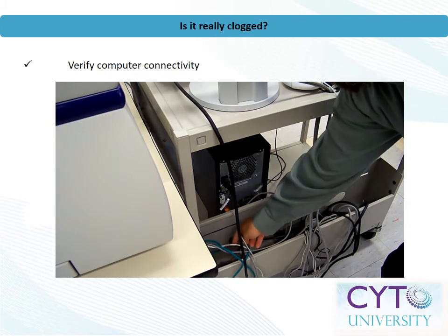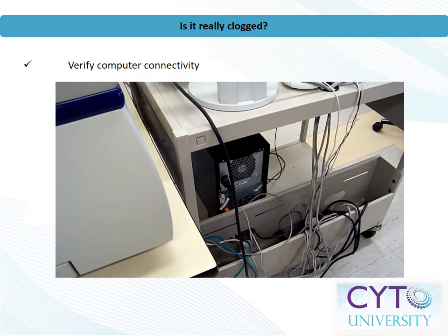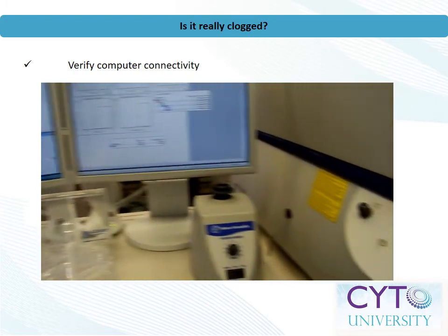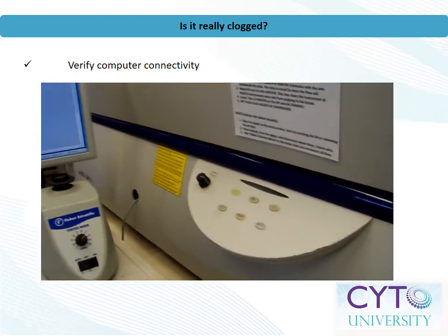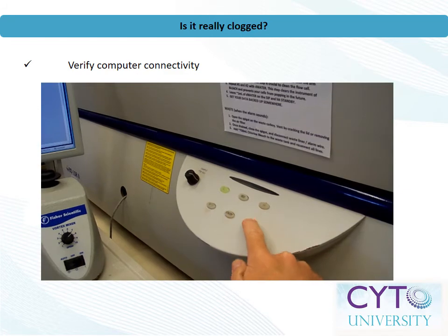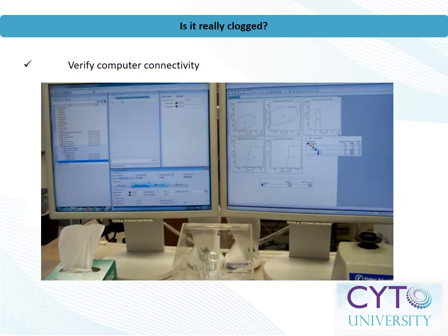Next, we want to verify that the cytometer's workstation has not physically or electronically lost connectivity with the cytometer. On some systems, connectivity can be confirmed by acquiring during a prime cycle. If you can see air bubble events appear, the cytometer is connected, and there may in fact be a clog.